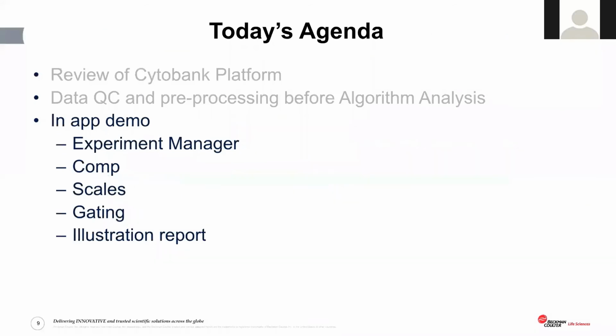So that was a brief introduction to the data QC, and now I'd like to move on to the in-app demo.